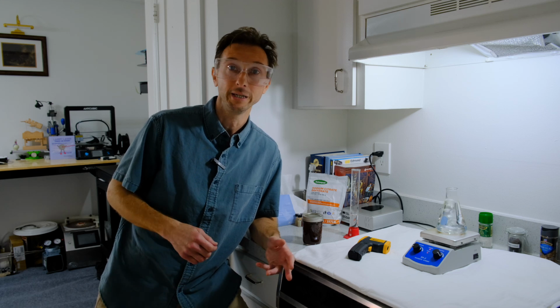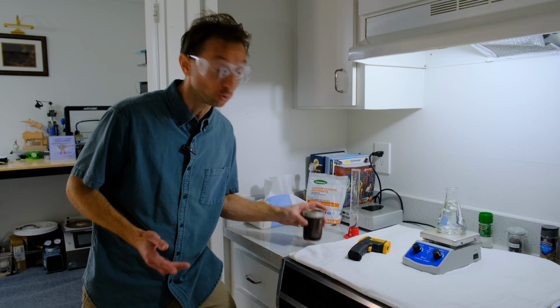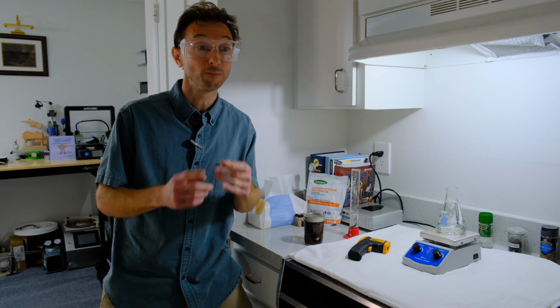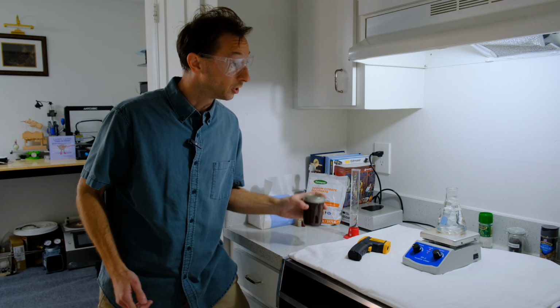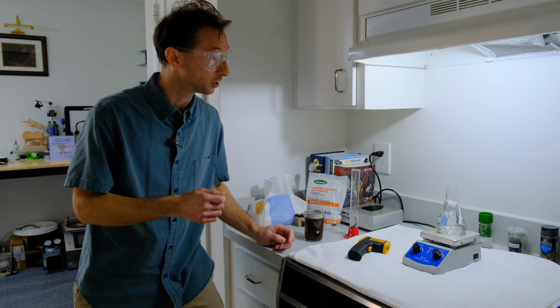What's up, everybody? So you may have seen some of my webinars and presentations with Photonics Media and other groups like that, and sometimes for those studies I have to make nanoparticles. I thought it might be cool to show you how we do that using precision chemistry and spectroscopy to both synthesize and then analyze those nanoparticles. And in this case we're going to look at gold nanoparticles. So the first step is to carefully create a boiling vortex just like so.